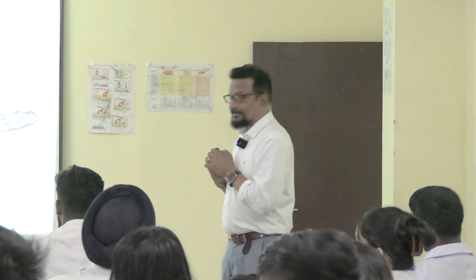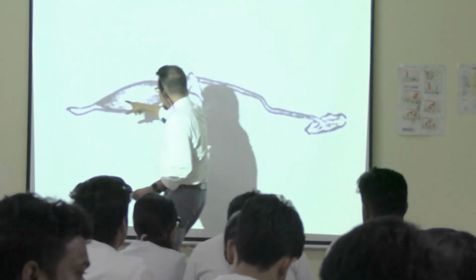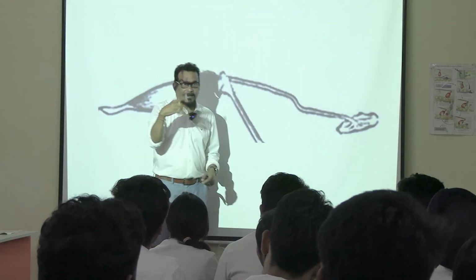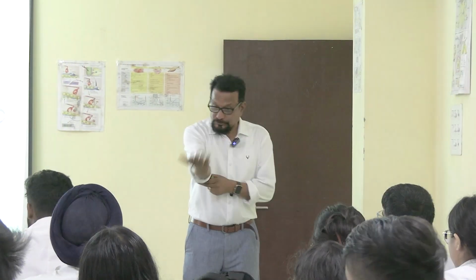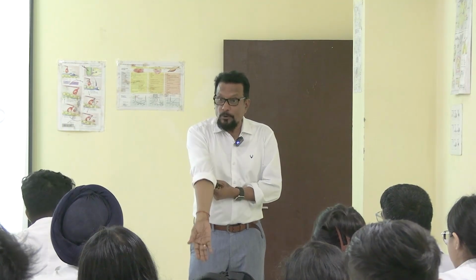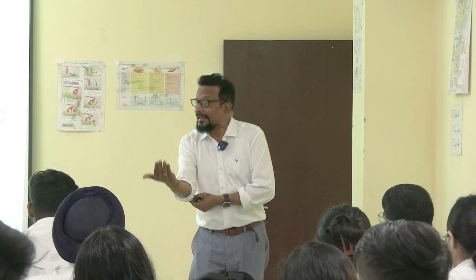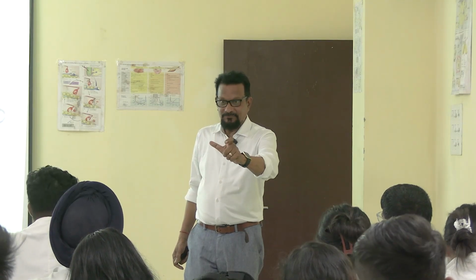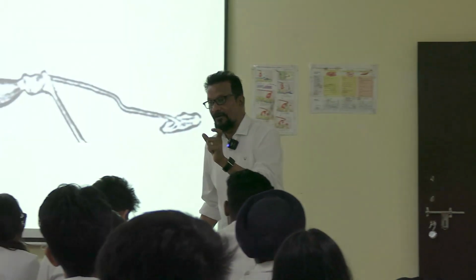Plus another thing: this end is connected to the lever, the short arm of the lever. This lever has some weight, so the muscle has to lift it. If there is no weight, it will immediately contract. If more and more weight is there, it will be delayed. So the inertia of the stylus, the writing arm, is another reason for delay.